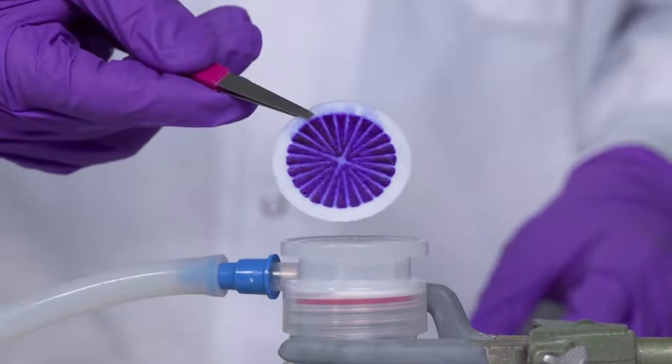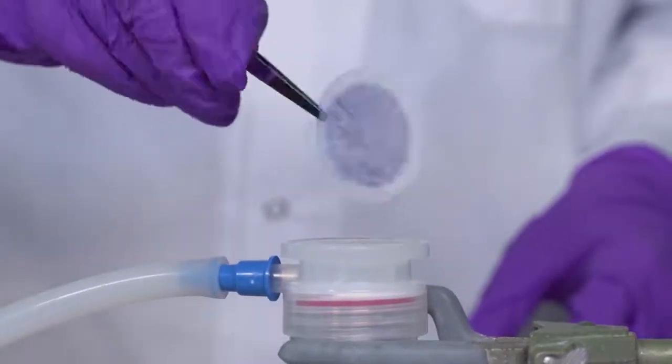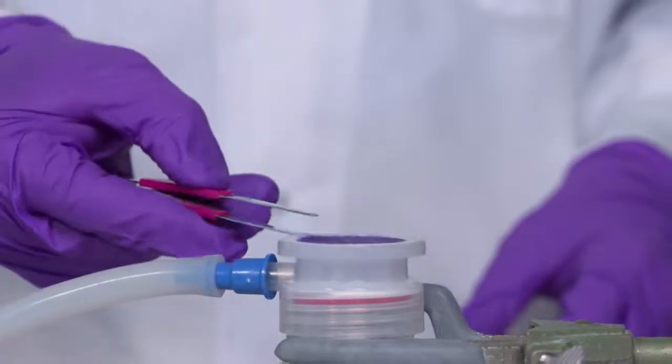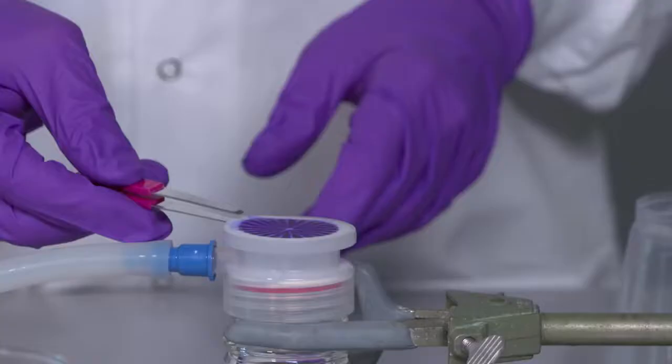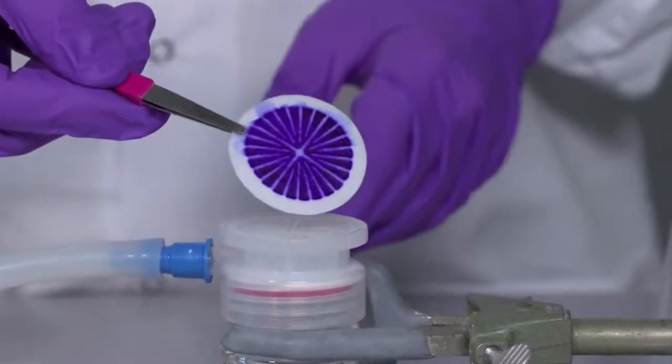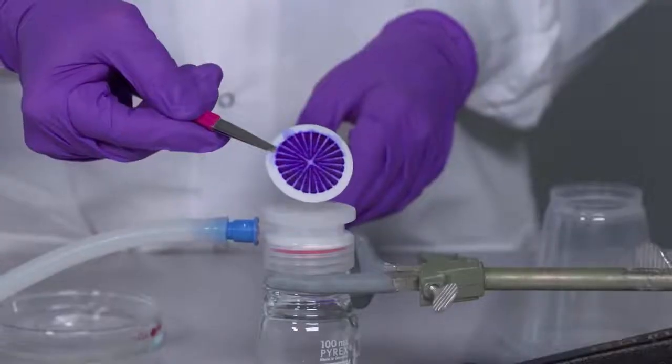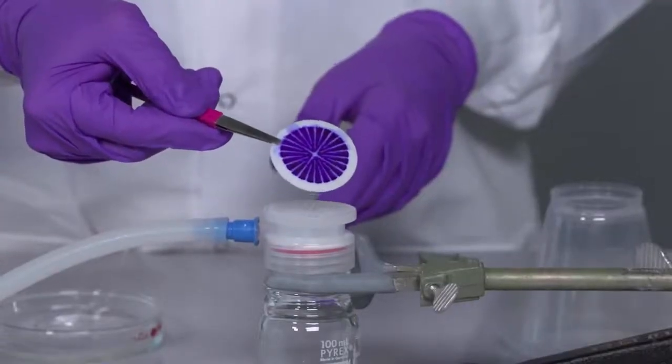After filtration is complete, you can remove the Natrix Q membrane from the Millicupflex and analyze either the filtrate or the retentate depending on your application. In the example of this dye solution, you can see that the Natrix Q membrane's affinity for this negatively charged particulate makes it useful in molecular purification.